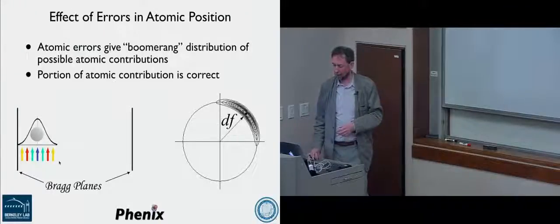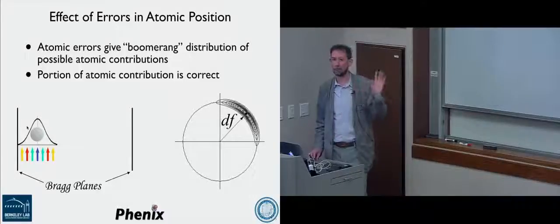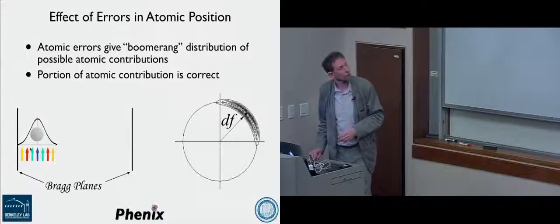And if you think about what's happening in real space, if you have uncertainty in the position of an atom, it could be something like this. The atom is here most of the time, but maybe it's shifted left or right. And let's say it's a Gaussian distribution because that always makes life a lot easier. So in real space, we'd have this.